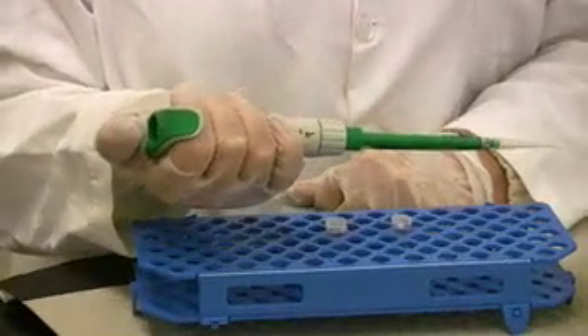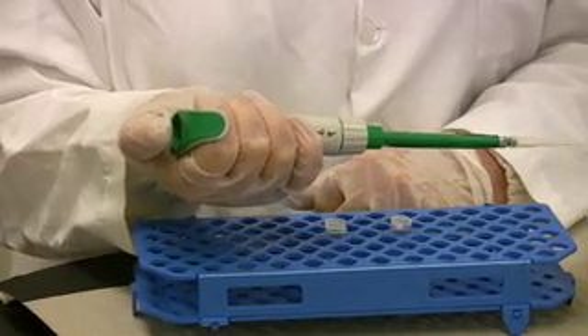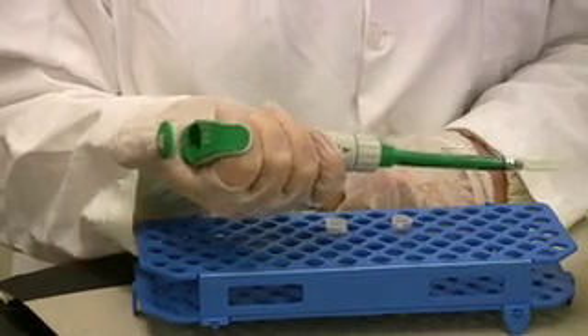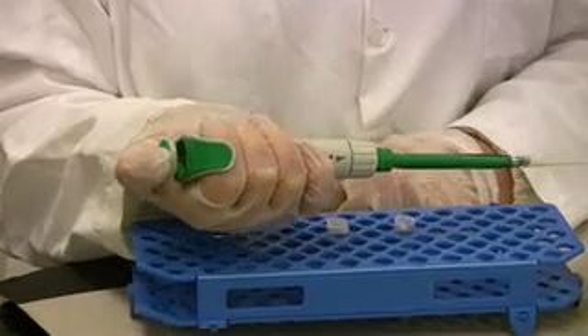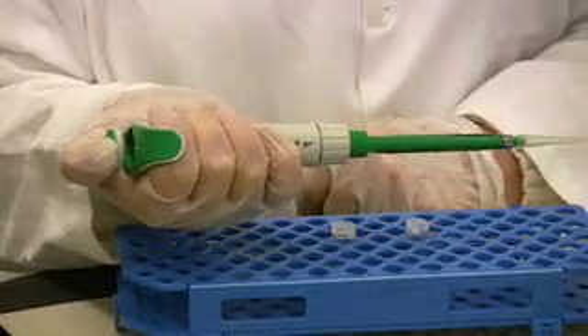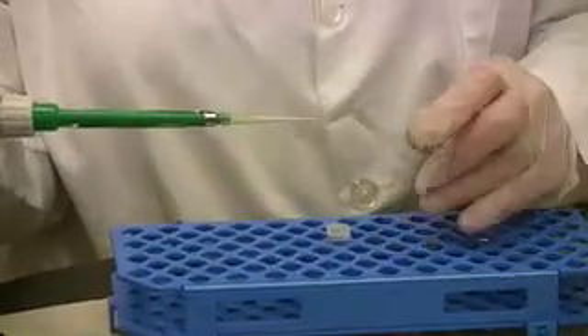The next thing is to depress the plunger. The plunger has two stops: a first stop and a second stop. When withdrawing a sample, you want to depress the plunger to the first stop. You do not want to go past the first stop, as the micropipetter is calibrated based on stopping at that first stop. I am now ready to withdraw some crystal violet.